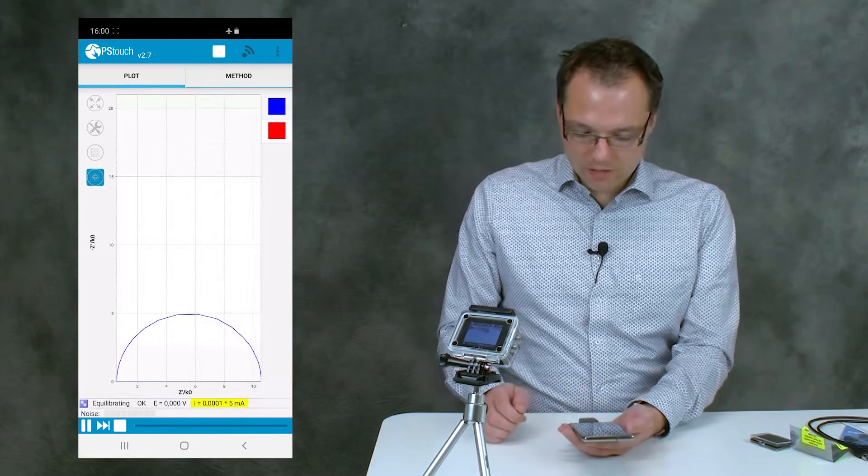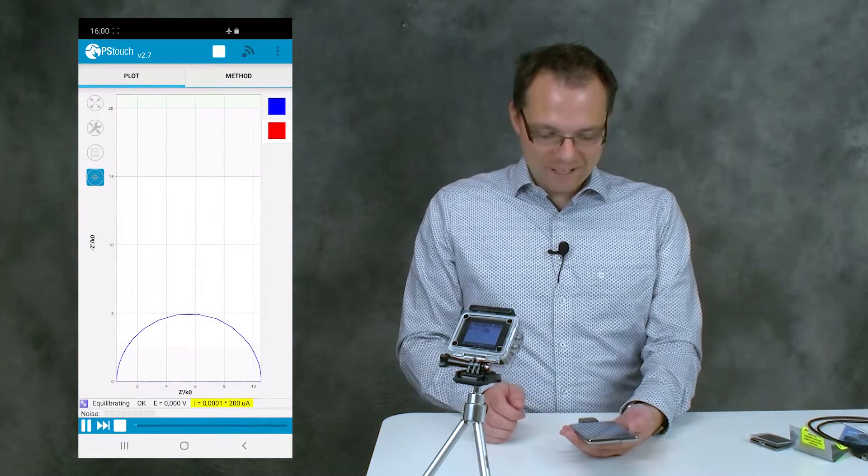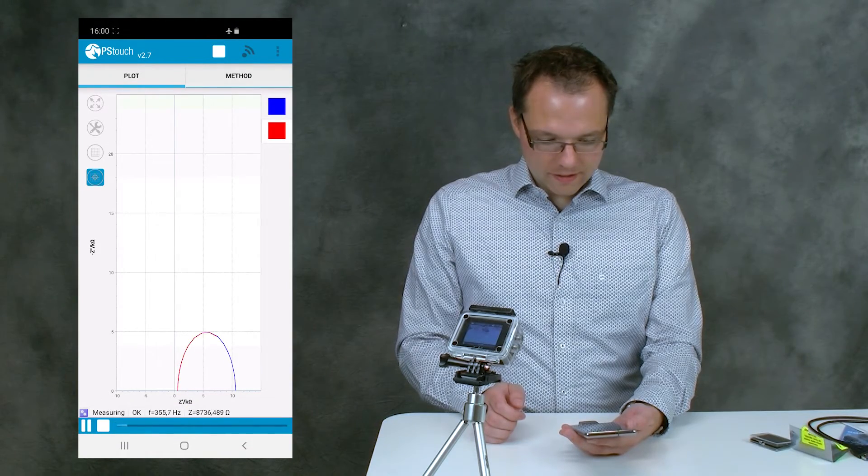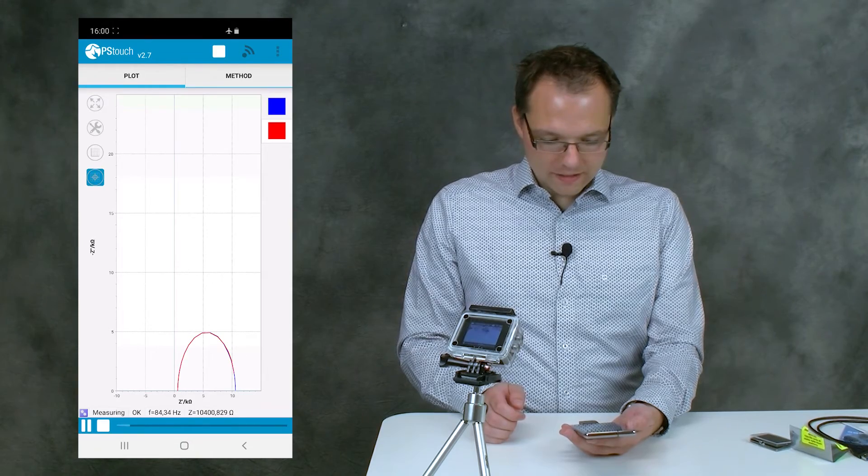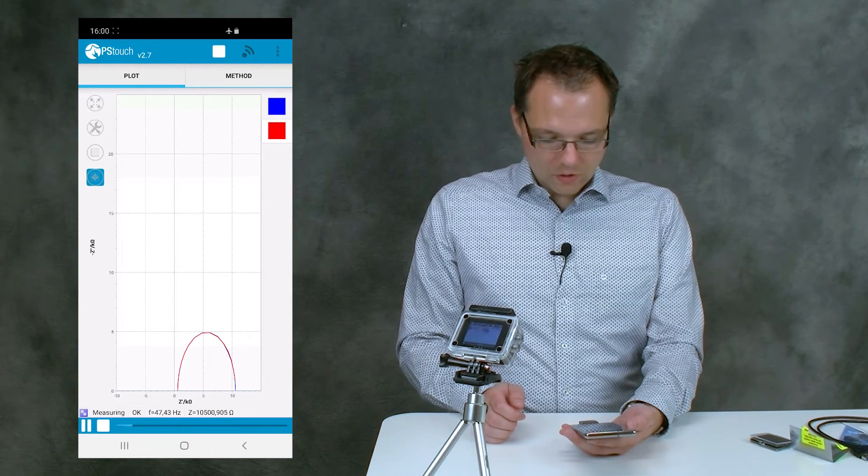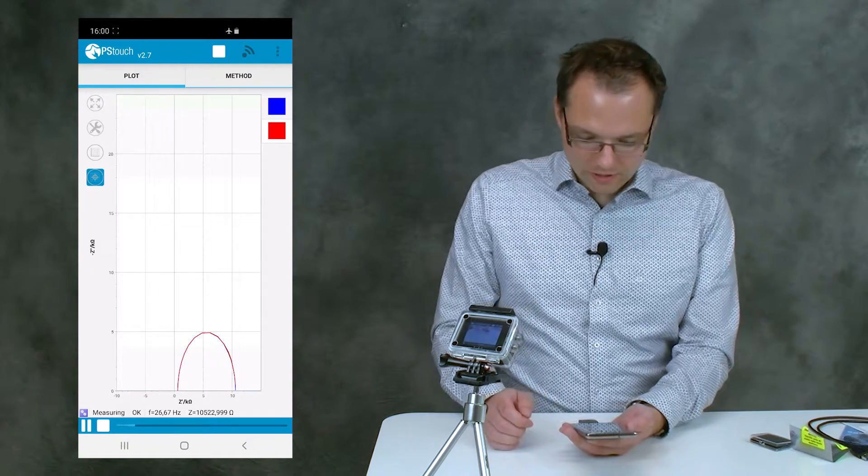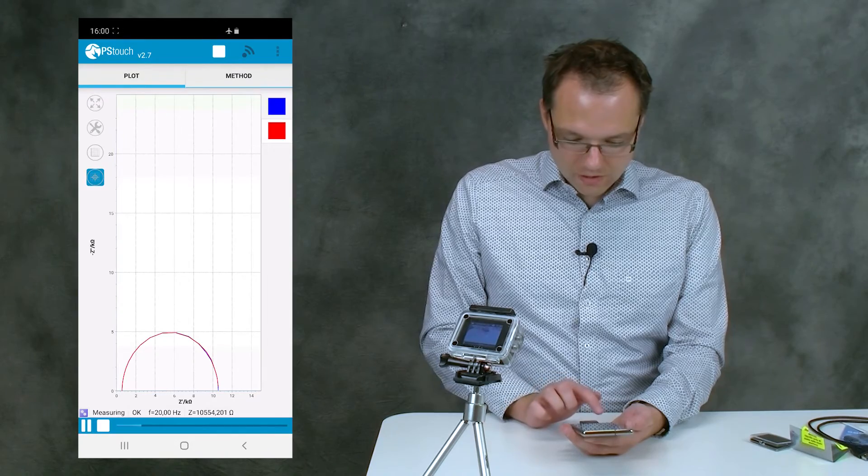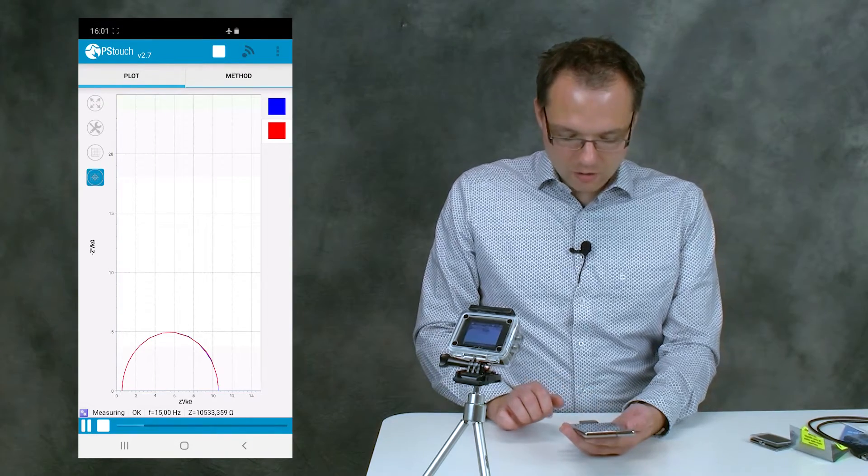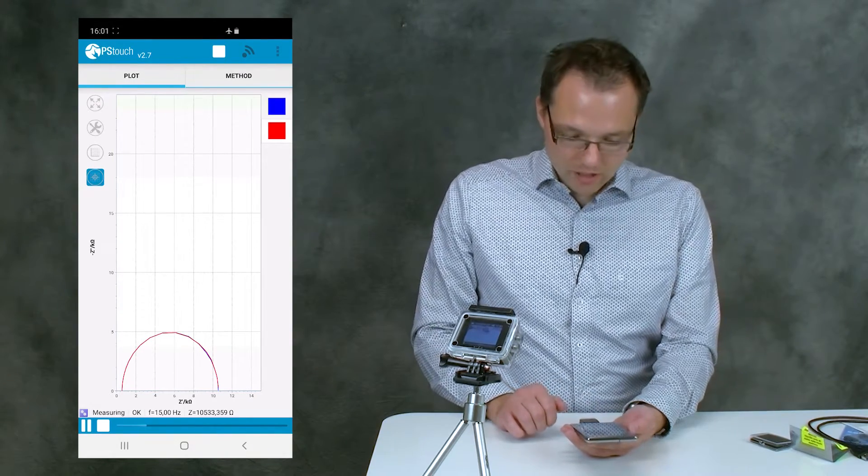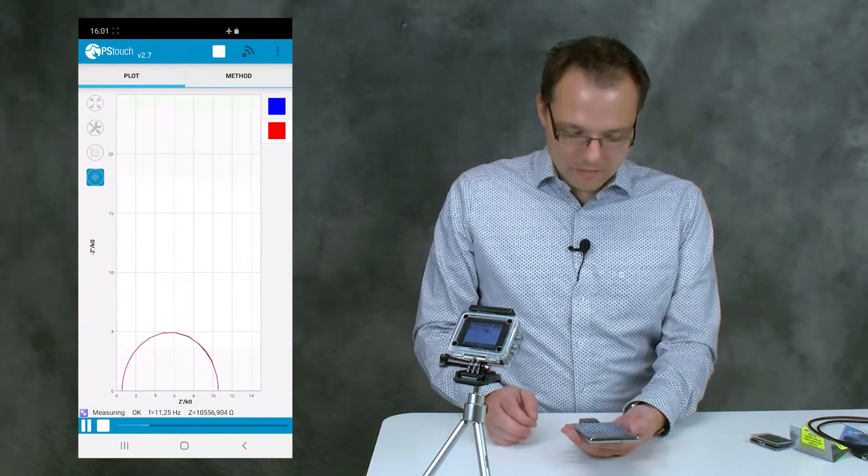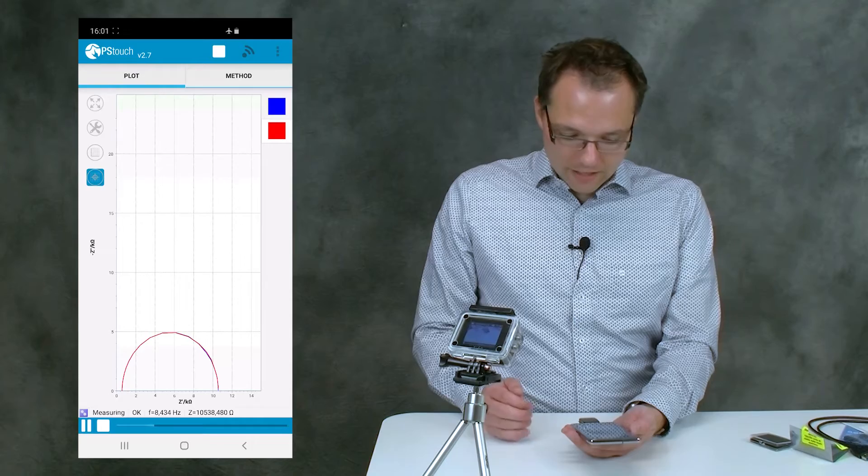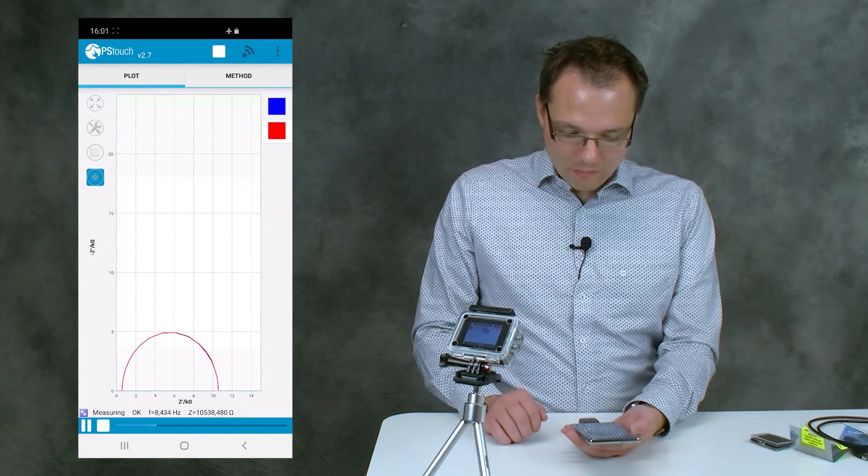And so to get the best view, you see the measurement running, and this is the zoom in. You see on the bottom how long we expect the measurement to run. As usual for an impedance measurement, the first frequencies were done very quickly, and now we wait for the remaining frequencies.